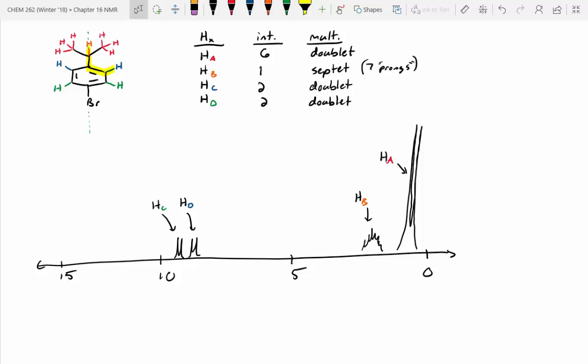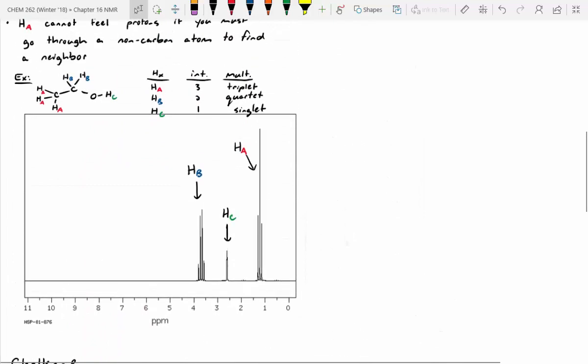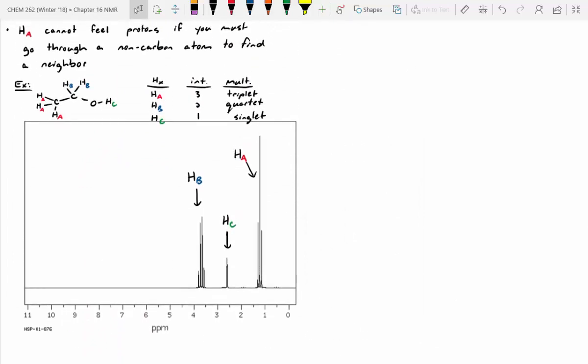So for the last example that we did with the ethanol one, the actual graph, for the HB, one of the peaks was higher than the other one. Is that common? Yeah, so you're bringing up the peak height, right? Peak height is different than peak area. What we're looking at with integration is the area underneath the peak, not just simply how tall it is. How tall it is doesn't tell you the area. That's a really good distinguishing thing to remember. Peak height tells you nothing.